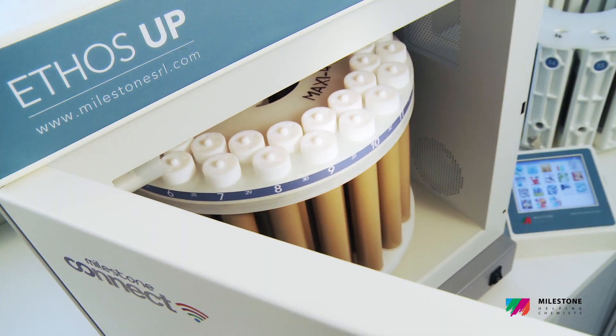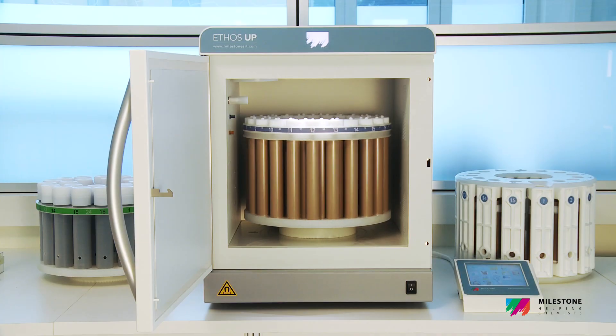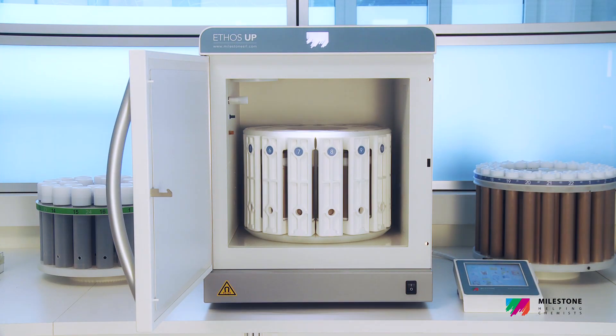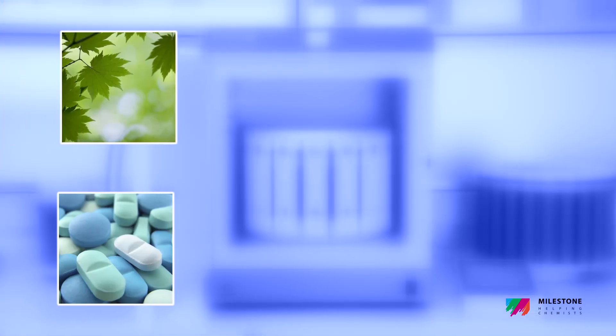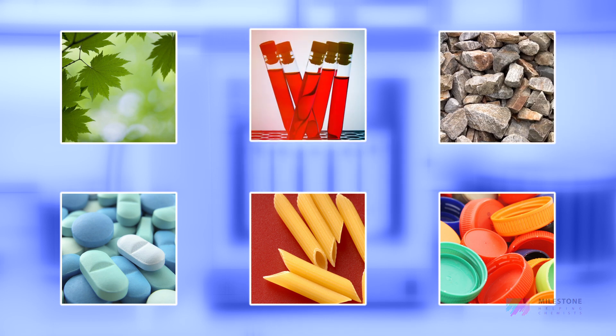The Ethos Up ensures impressive ease of use, superior performance and high productivity, perfectly matching the application's needs with a wide variety of applications, such as environmental, pharmaceutical, food and feed, polymers, mining, geological and many others.